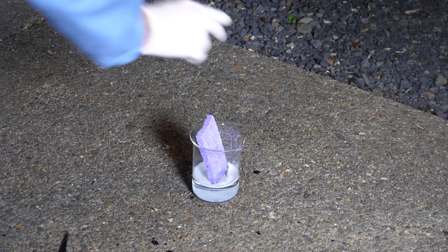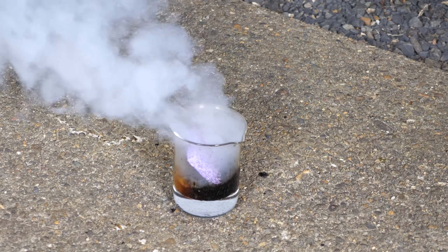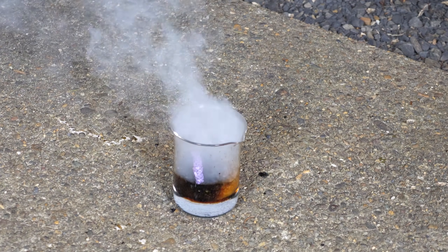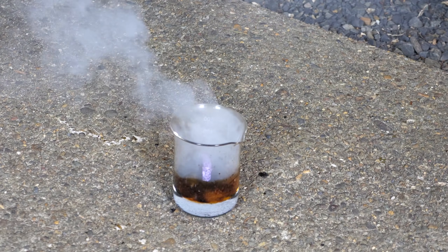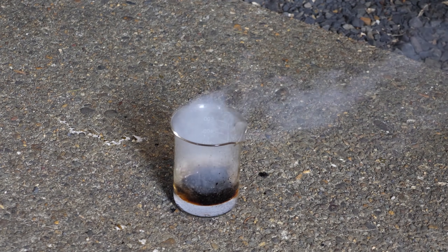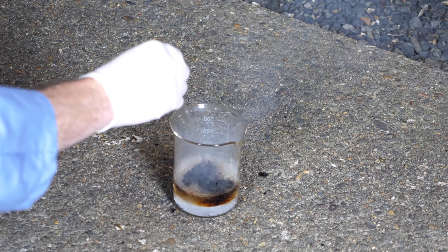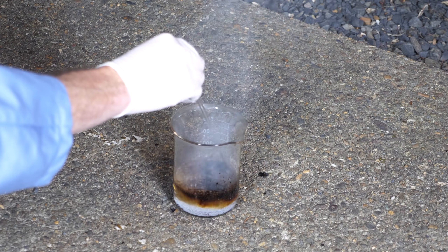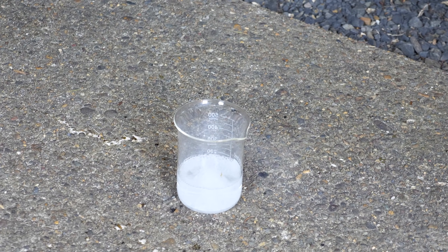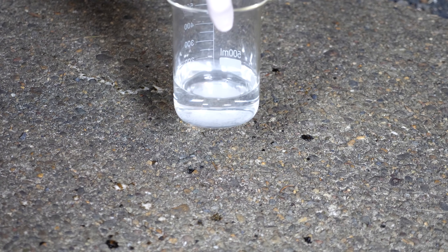Now watch what happens when I put a sponge in this. It's just dissolving it into nothing. Now it's a completely clear liquid again — no sign of the sponge whatsoever. That is crazy.